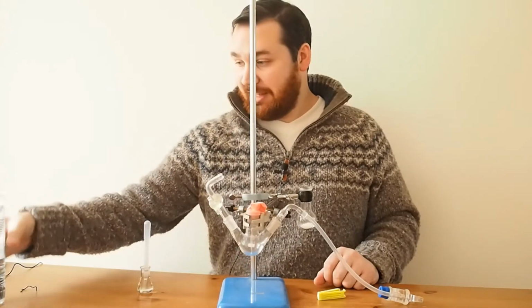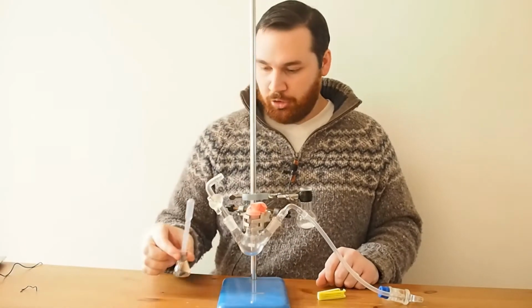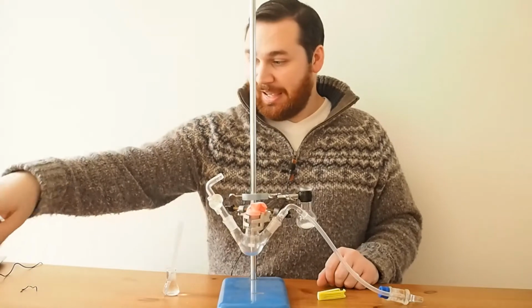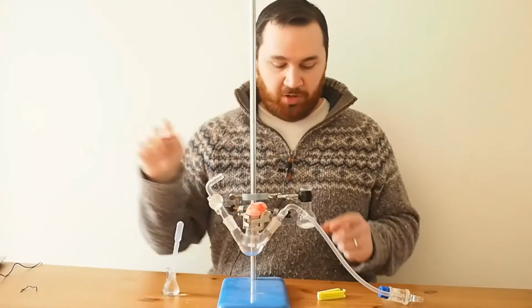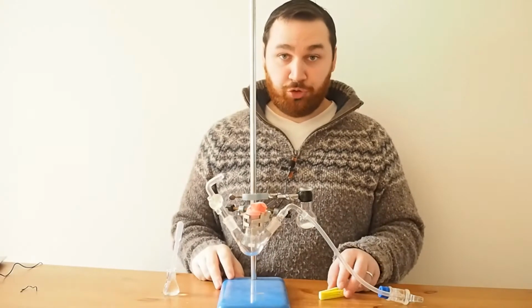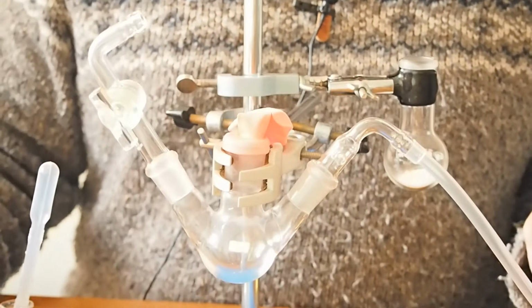And what you're going to need is some vinegar. I've got it here in a little conical flask, and some bicarbonate of soda, which I've got here at the back. Now we'll zoom in and have a look. So let me talk you through this apparatus.